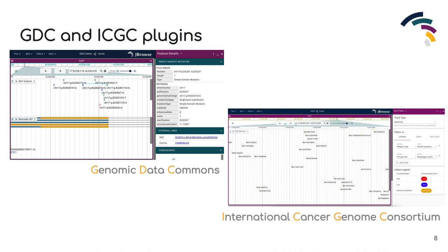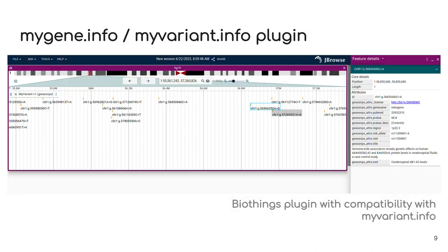To assist in cancer biology discovery, several plugins have been developed to connect JBrowse with various cancer datasets and resources. Chiefly the GDC and ICGC plugins enhance a user's instance of JBrowse2 with data adapters for the API endpoints for each of these data consortiums. New track types within these plugins are available for users to browse and filter the aggregate data directly within the application. There's also the BioThings plugin which connects APIs from resources such as MyVariant.info and MyGene.info to JBrowse, providing rich gene annotations from these data centers to a given session without extensive user configuration or intervention.